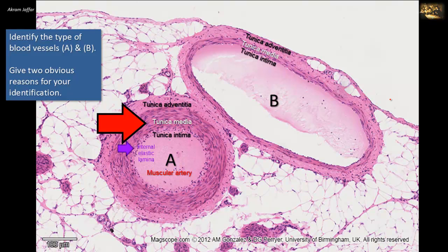Yet, we can clearly see that the tunica intima is crinkled because of the presence of the internal elastic lamina. In the vein B, you can see that it has a larger lumen and a thinner wall in comparison to the accompanying artery. Thus, it is easily deformed in tissue preparations. In addition to that, the thickest layer is the fibrous tunica externa, in contrast to the artery whose thickest layer is the tunica media which is made of smooth muscle fibers. Note that the intima is smooth since there is no internal elastic lamina. So, the intima is smooth and not crinkled like the intima of the artery A.